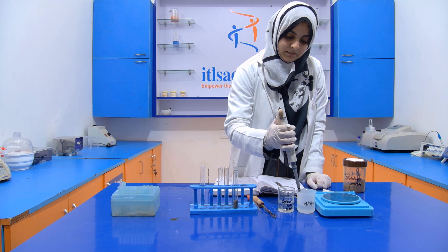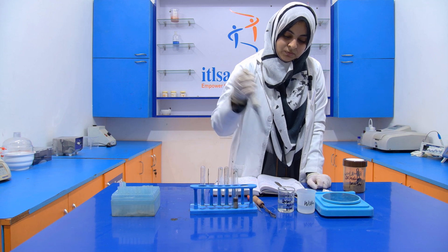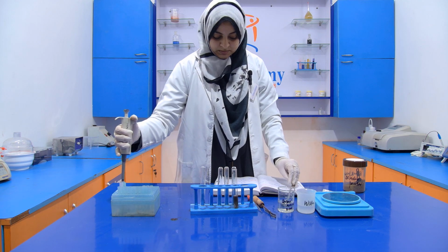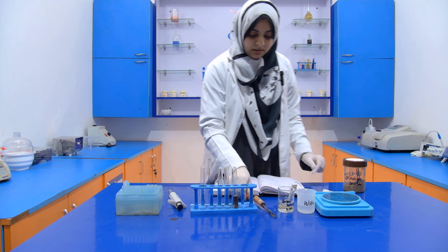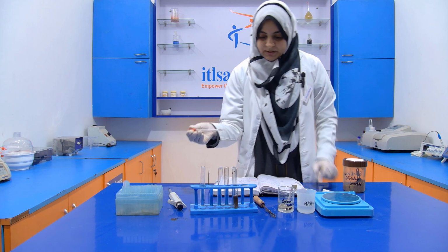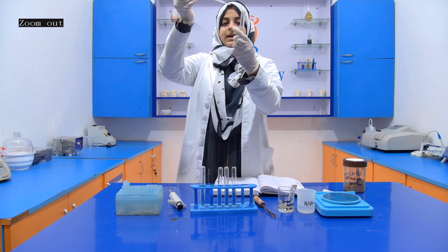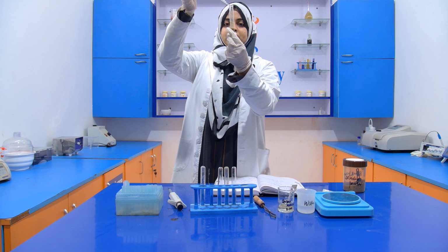One, two, three. Then we have to add 1 to 2 drops of silver nitrate into it. Mix it properly. Now add this, 1, 2.